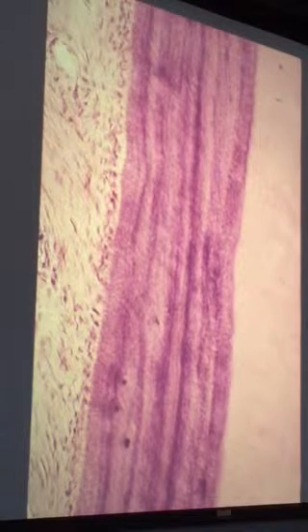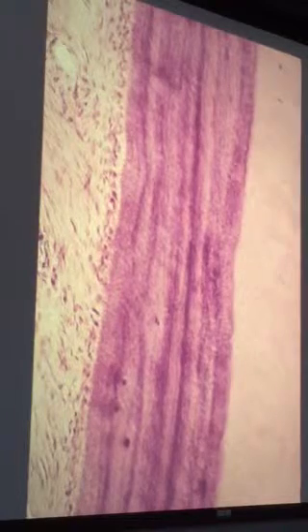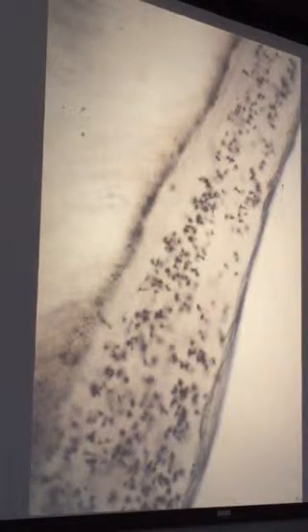Acellular cementum. How about this line of cells we see right there? Cementoblasts, and what are these? Incremental lines. Okay, and there's acellular cementum again, and let's go on to the next slide.